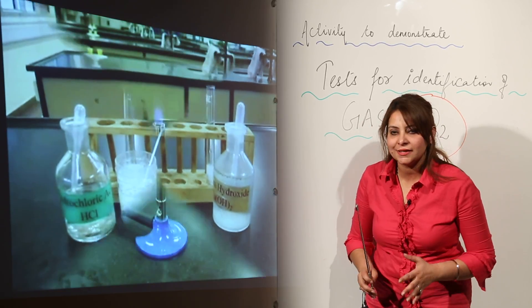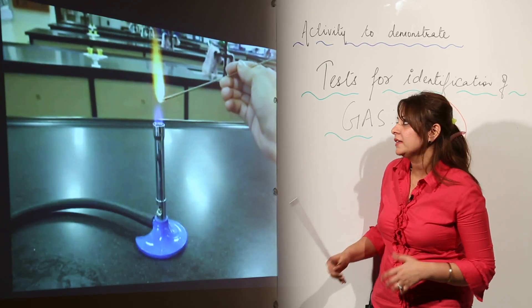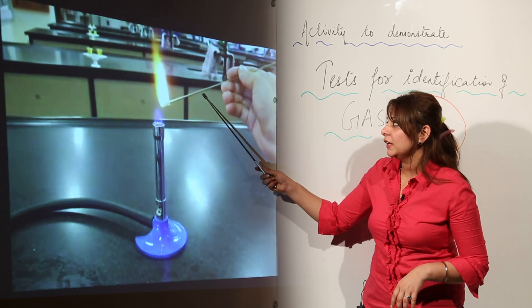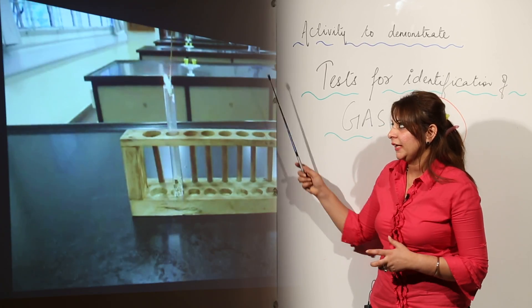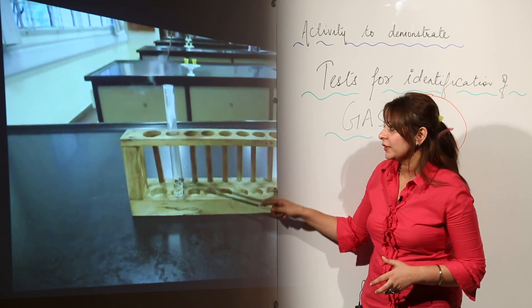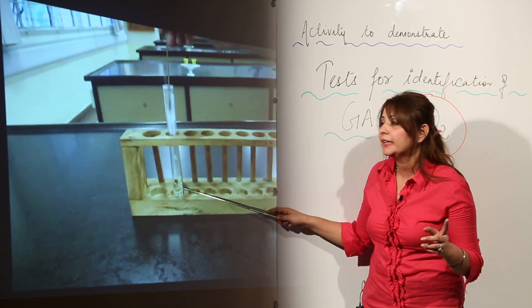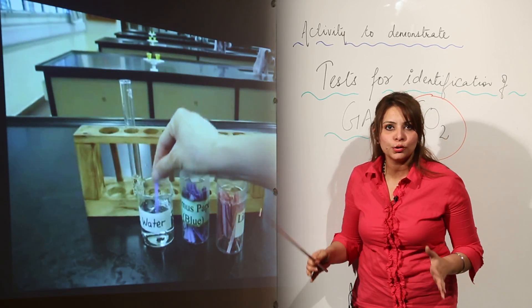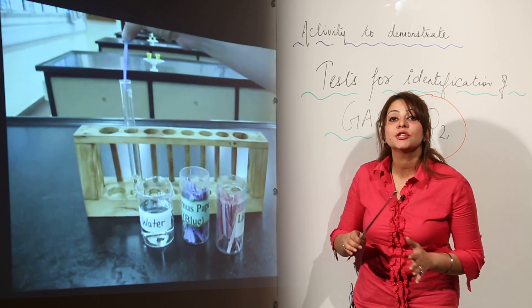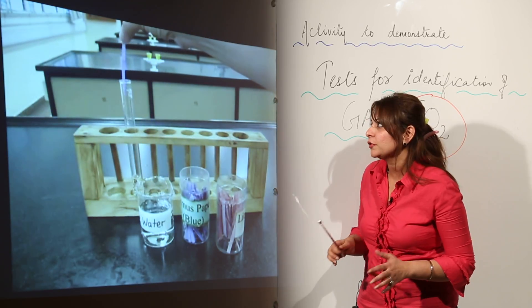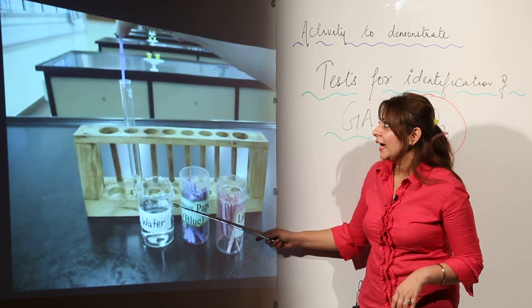This is one of the tests which shows that when carbon dioxide gas is passed through lime water, it turns lime water milky. We have one more test — we are lighting this splinter and bringing it to the beaker which contains the carbon dioxide. It blows off because carbon dioxide gas is a non-supporter of combustion.